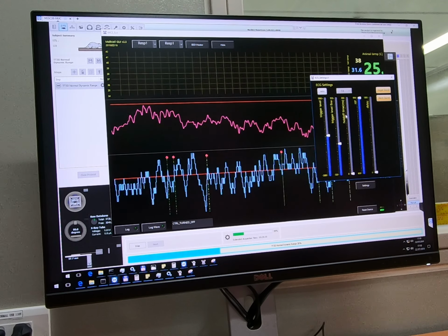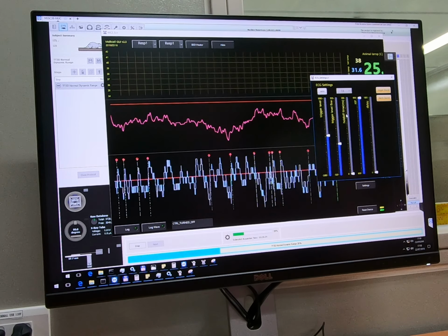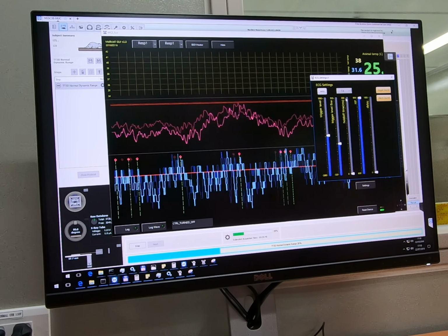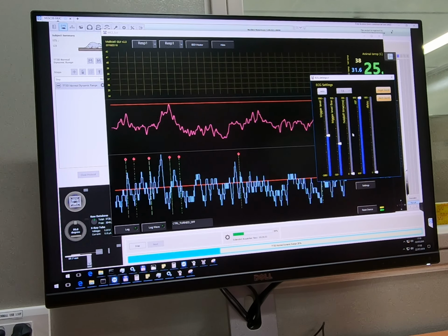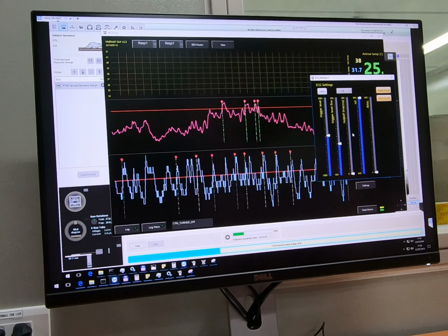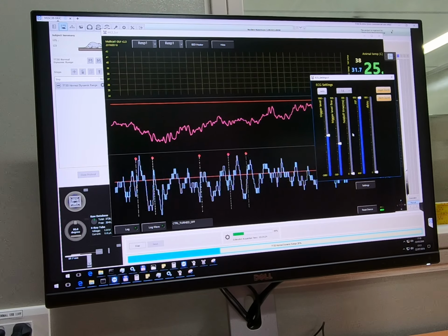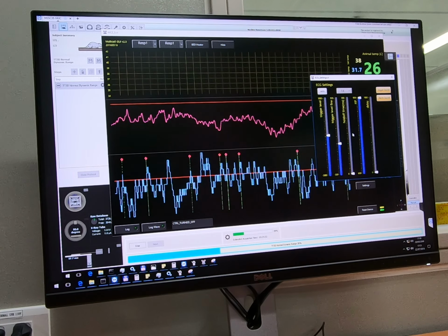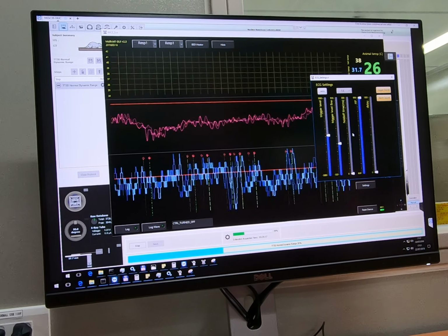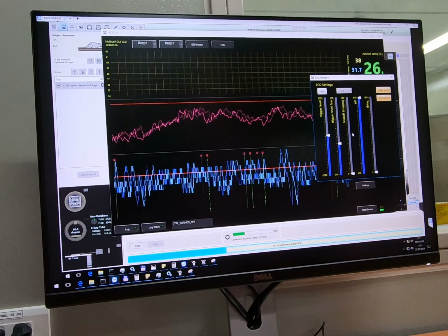The third one is the hold off time. So the longest time you can select here is 300 milliseconds, I guess. Maybe seconds. That time period will be set up so that, even though there is a peak which could have been considered by the system as a trigger signal, because of the hold off setup, the system will skip it.